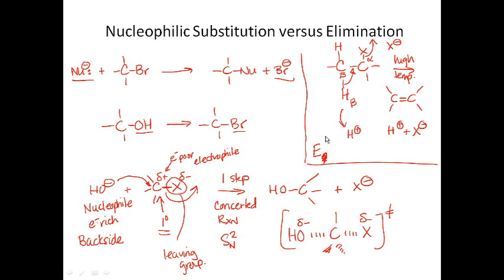You might say, well, is there anything pulling off this hydrogen? And the answer is, you could probably say that the water is basically collecting the hydrogen after it becomes H+ to form the hydronium ion. But the water's not actually taking an active role in pulling the hydrogen off. The thermal energy in the reflux will cause this H+ to be lost.